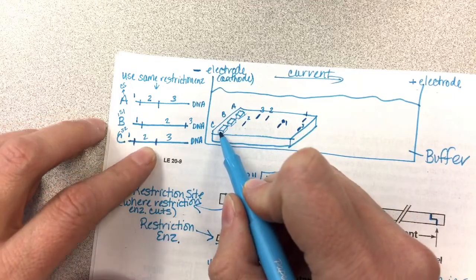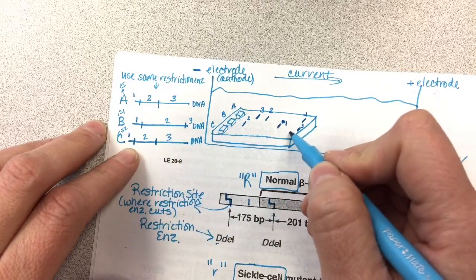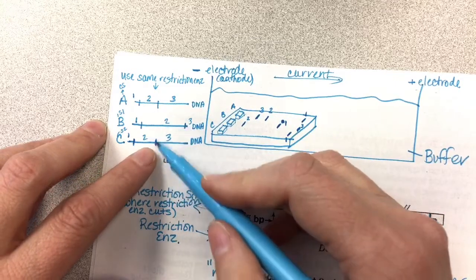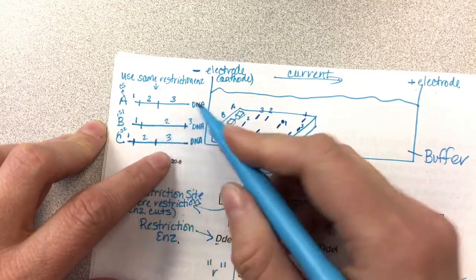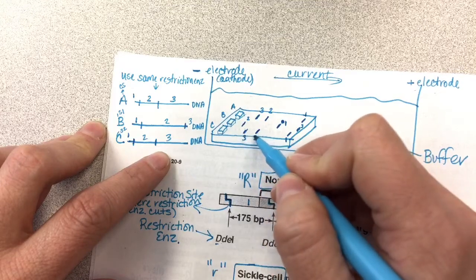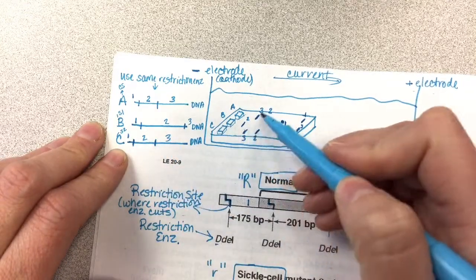And then C, this one looks exactly like this one here. So that's going to be about right in the same area here. So that's 1. All right, and then look, these are about in the same spot. So the 2s. And so if this was a crime scene, and the 3, if that's the same, 2 and 3, then the crime scene DNA seems to match suspect 2. All right, and so that's how we look.